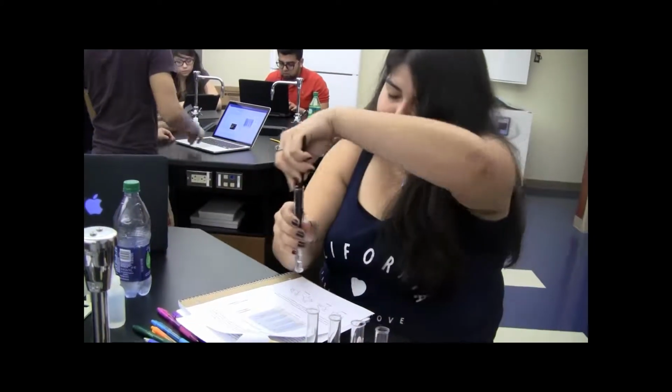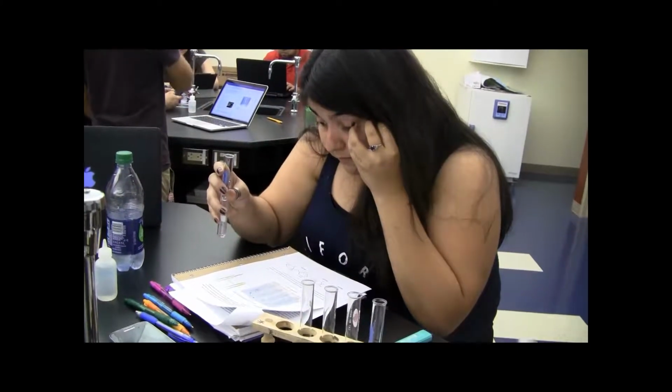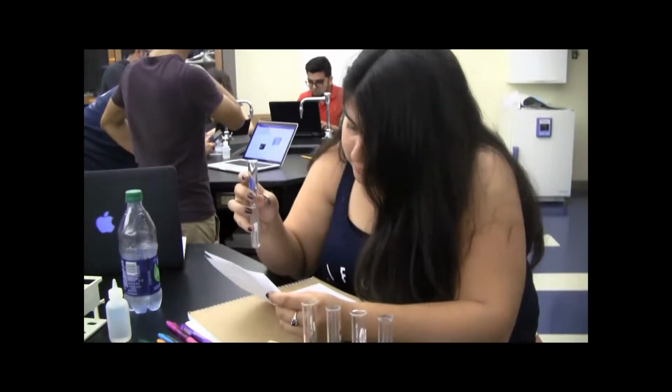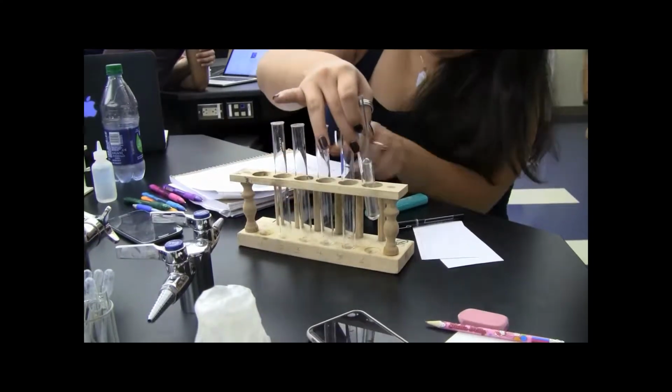I'm scared. The goal is to prevent water from spilling from the small tube. It says it's important to start with a small bubble. Is there a small bubble? Yeah, there's one right there. It says we have to measure the size of the bubble. So it's important to start with a small bubble.